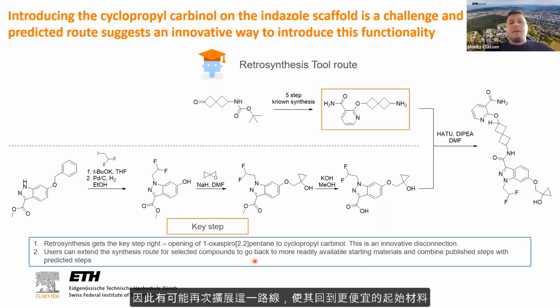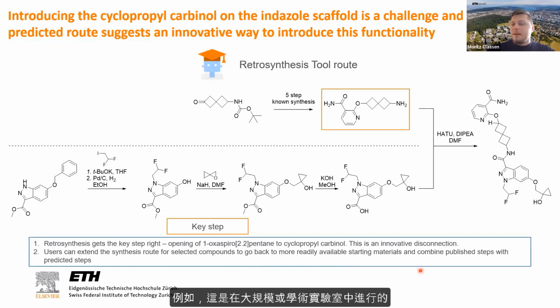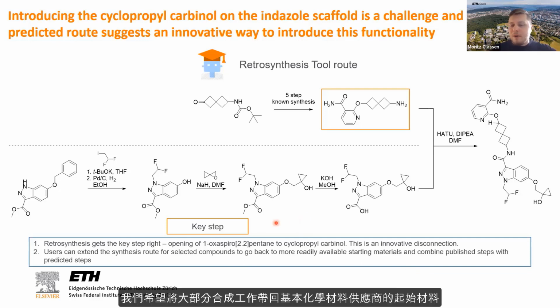So again, it is possible to extend this route, bringing it back to cheaper starting materials if, for example, this is done on larger scale or in an academic laboratory where money is an issue. And I would say personally for ourselves, this definitely is important, that we want to bring most of our syntheses back to catalog supplier starting materials.